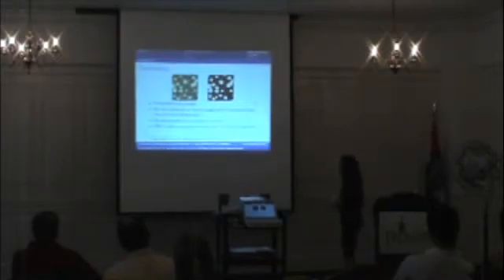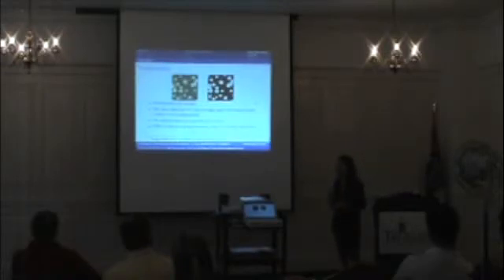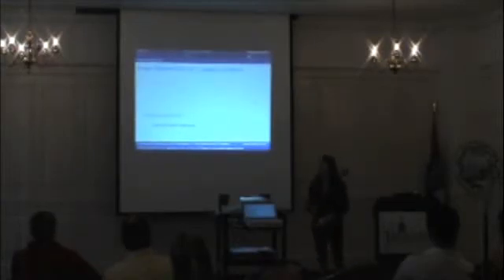One other important thing about thresholding that is not too great is that there's no requirement for a continuous curve. And going back to things we really want to pay attention to when picking an algorithm, we want a continuous curve because we want our cell boundaries to be closed and continuous, because cells are closed and continuous. So the first general class of segmentation methods I'm going to talk about are contour-based.